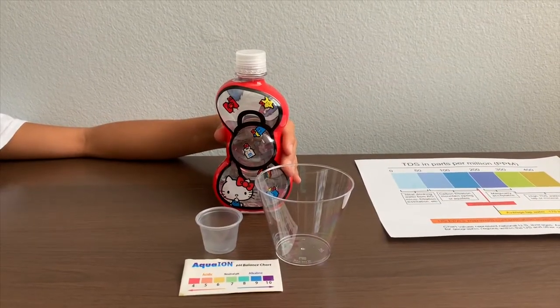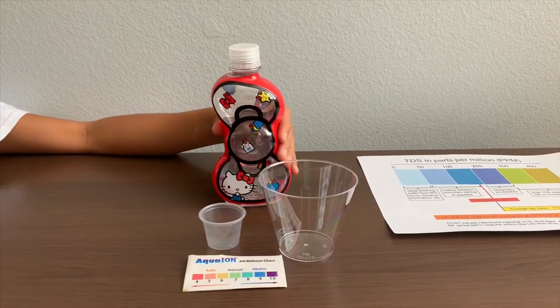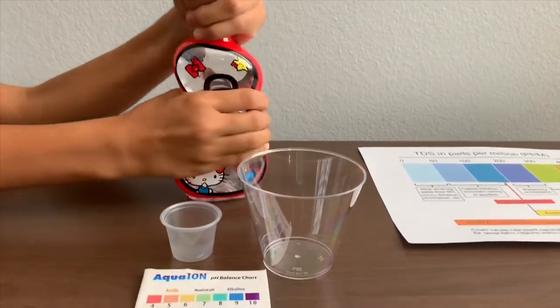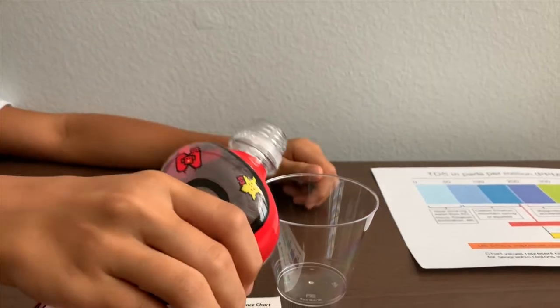This is Hello Kitty Purified Drinking Water. It is a product of the USA. Let's test and see the pH and TDS levels. Let's pour some water in.